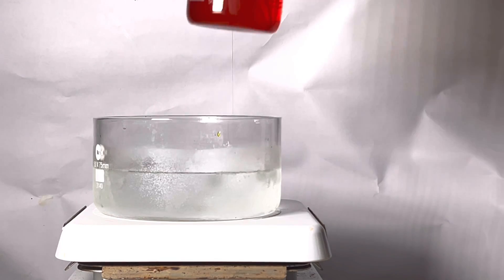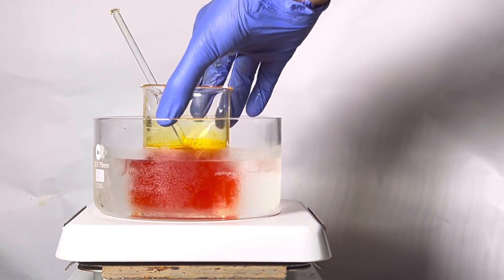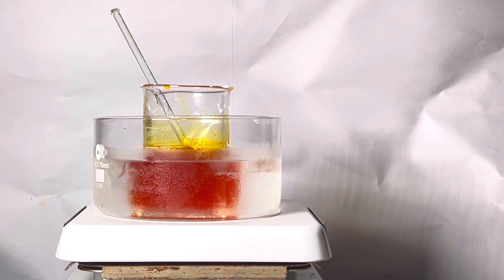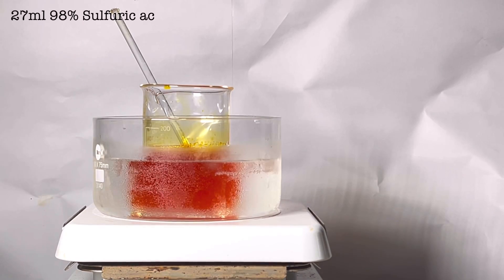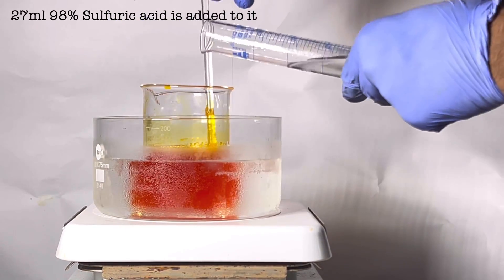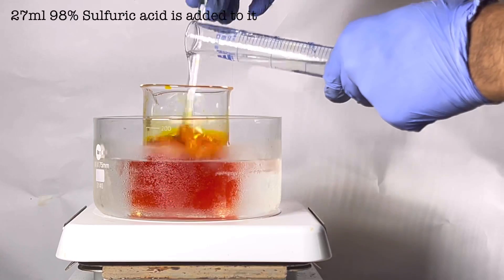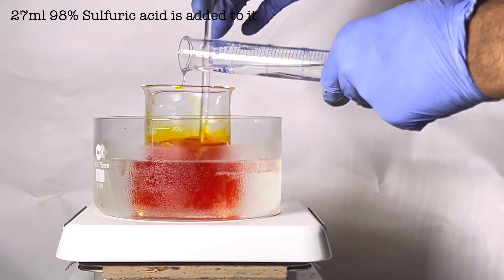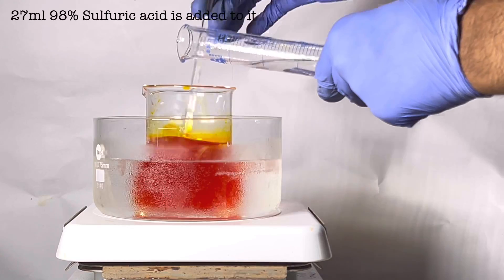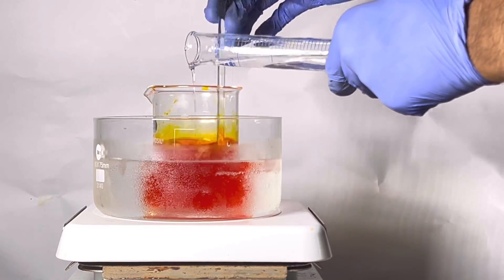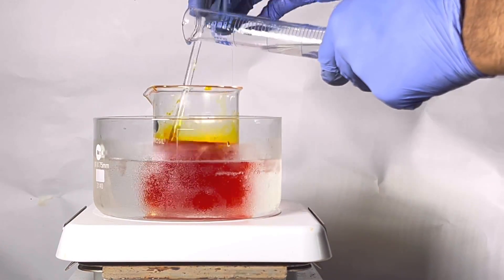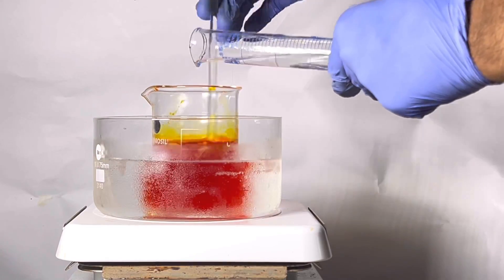Next, the sodium dichromate solution was immersed in an ice water bath to chill down the temperature to less than 15 degrees Celsius. 27 milliliters of concentrated 98% sulfuric acid is added to the chilled solution with stirring. You can notice how the color of the solution changes from orange to red. Here, the chromic acid is produced in situ.